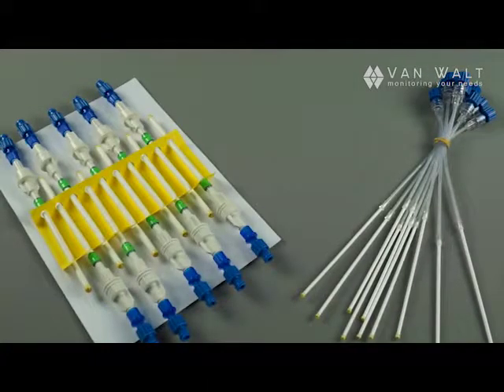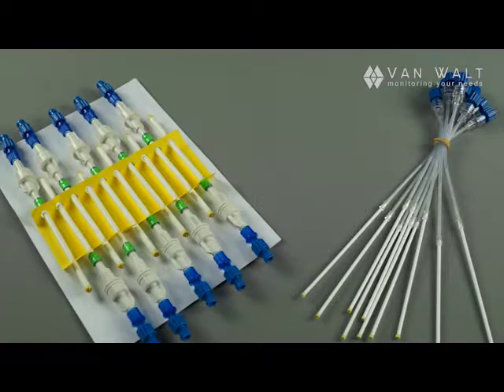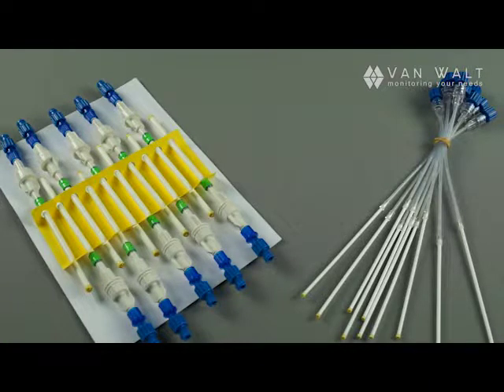Good morning. This morning I'm going to talk to you about some sampling devices for soil pore solution and in particular the rhizome samplers.